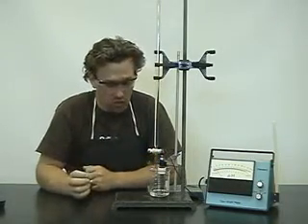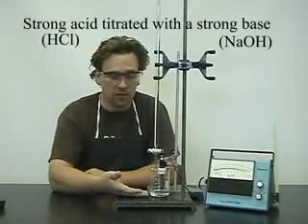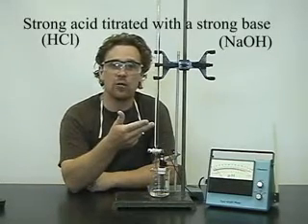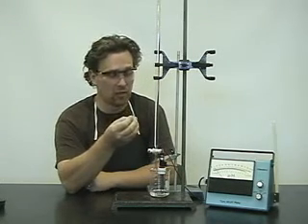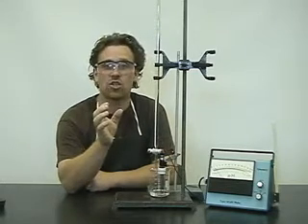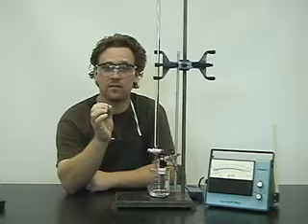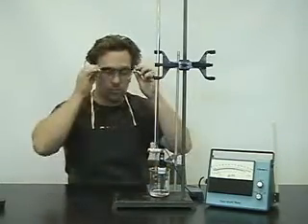The first titration curve, we're going to have a strong acid, HCl, titrate it with a strong base, sodium hydroxide. From the data collected, we're going to graph the pH on the y-axis, and on the x-axis, we'll have volume of sodium hydroxide added.